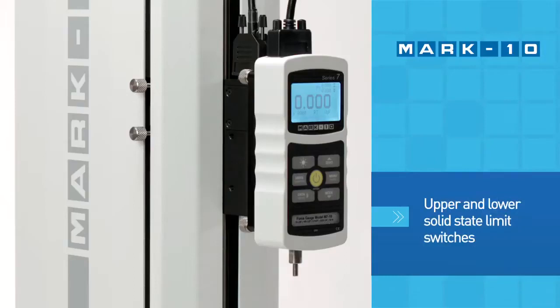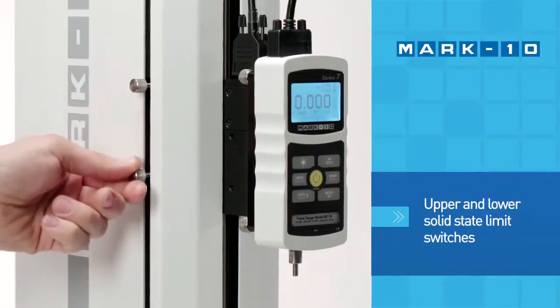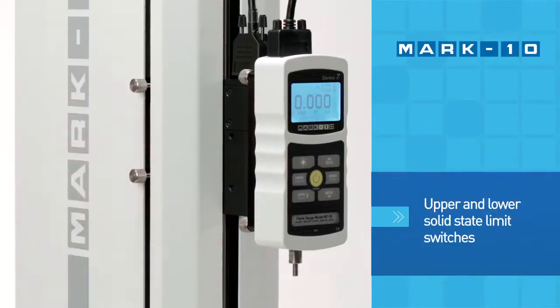Upper and lower solid state limit switches can be positioned to prevent over-travel or as a test-end condition.